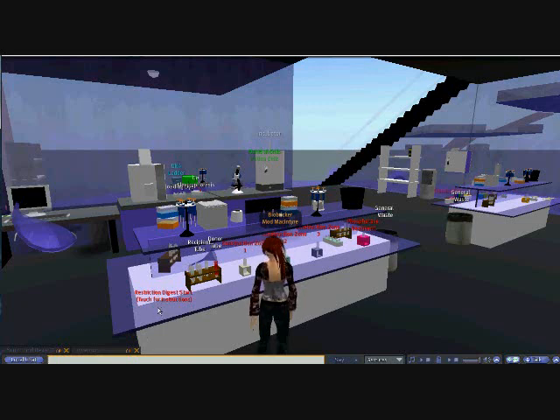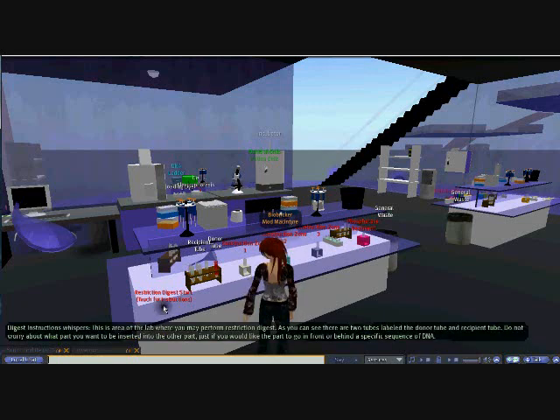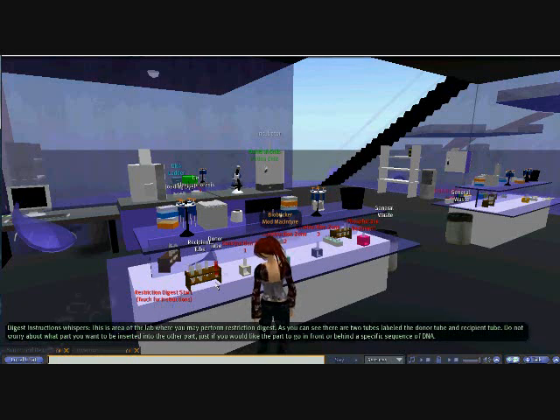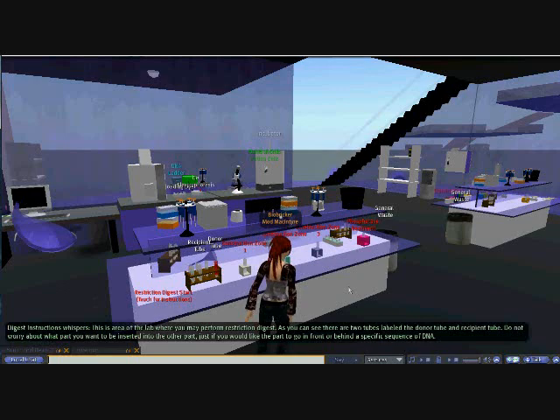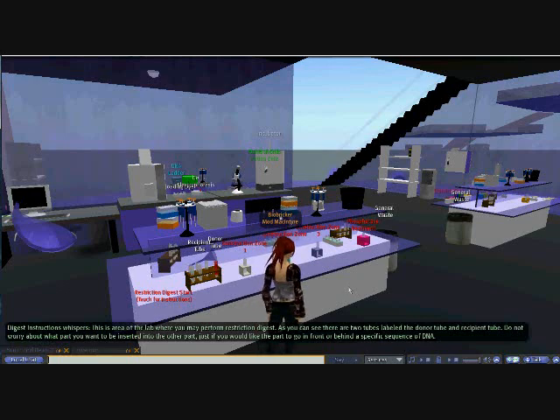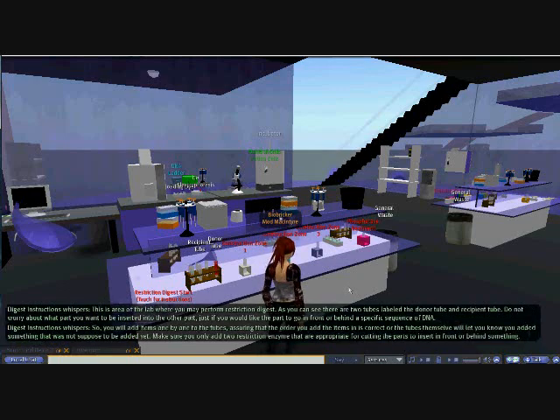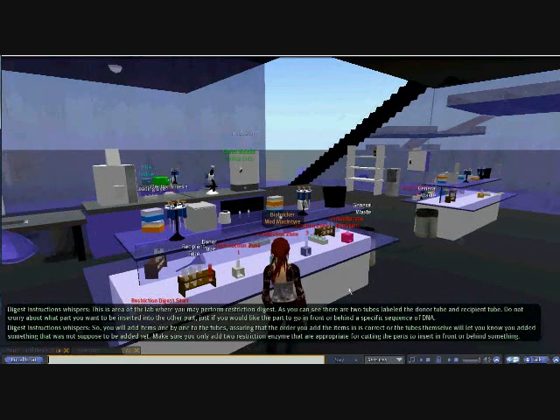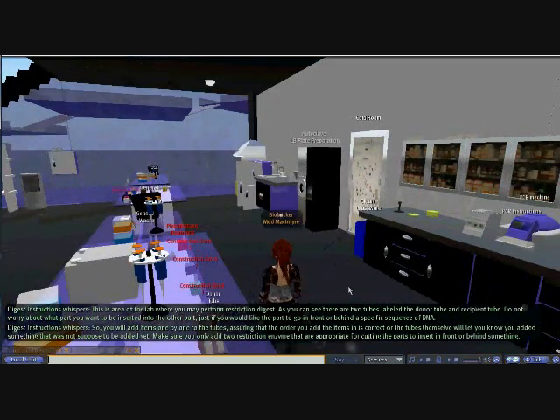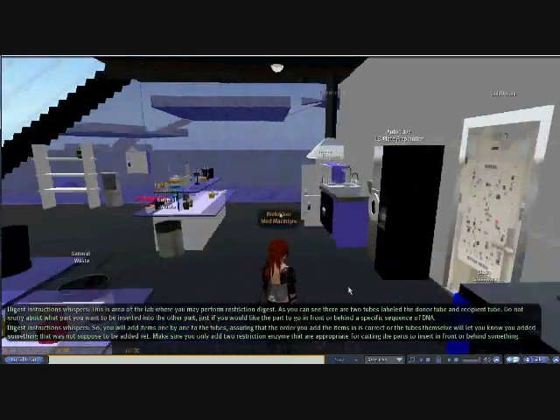So you can see explanations for the different areas for Restriction Digest, and they should have the areas they talk about glow, although due to the resolution of my computer you cannot see it at this time.